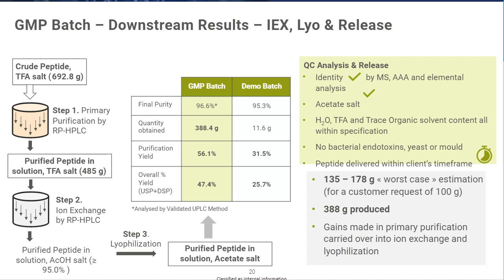And only from there, we also perform HPLC, of course, and elemental analysis. Through all these tests, we can then basically get what's called the peptide content. So this is the actual percentage of peptide in the powder relative to all the other components, like the water and the counter ion itself. Based on the purity of the peptide, we then perform a calculation which gives you the peptide content, which is typically reported on the certificate of analysis at the end of the campaign. So this gives you the true idea of how much peptide is in your final powder.